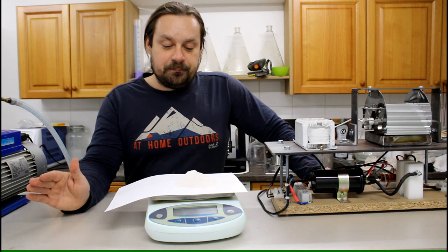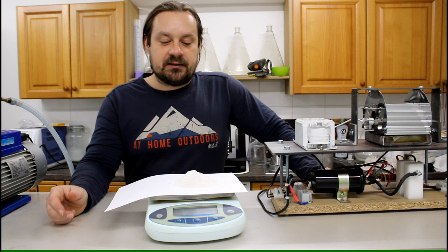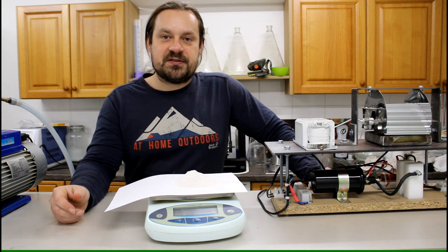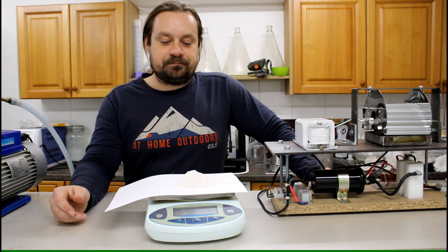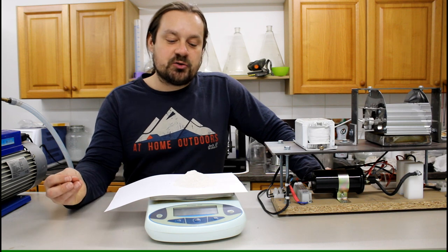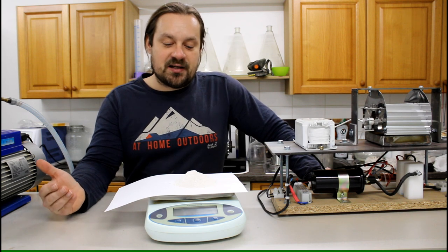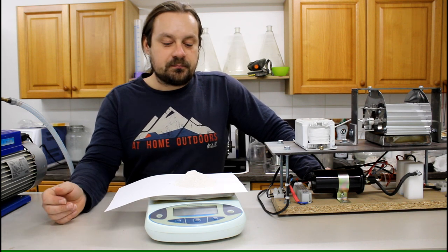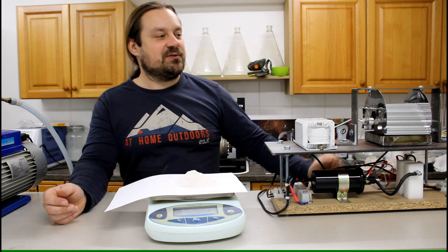And actually, I consider this video now as finished because it covers everything, how to simply use a lye boil method to get this metal precipitate. And in an upcoming video, I will give a procedure how to get the values out of that white powder, how to get the precious metals out of that particular white powder. And I already can tell you the first step is done with a machine that you can see here.